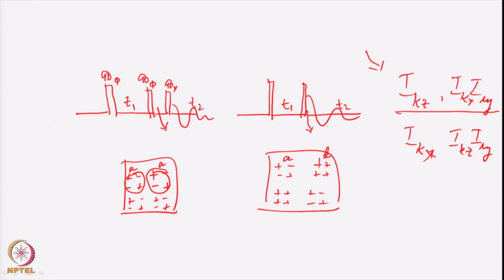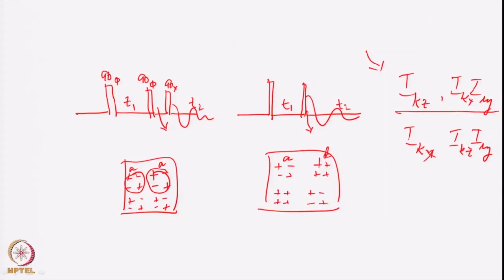In fact, this brings in a new concept, a totally new thought with regard to manipulation of the magnetization transfers and manipulation of the nature of the spectra. So, that is something which is quite important, and it becomes applicable in many other experimental sequences as well. So, I am going to demonstrate to you one more such application where we choose a particular kind of magnetization, namely the IkZ. We will choose IkZ here. Okay.